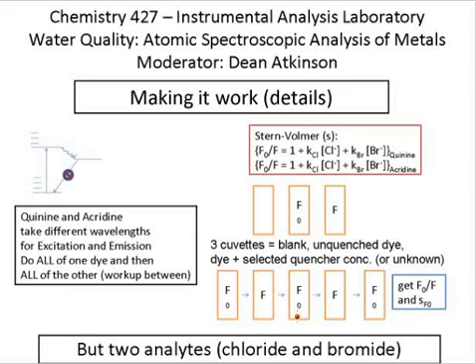Okay, so the reason for measuring the F naughts on either side of the F is that you can check for drift, make sure that your value of F is constant, and make sure that your value of F naught is constant. But if you're going to measure on either side, and you'd like to measure 2 values of F to get an average value of F, then why not put one more F naught on the other side?